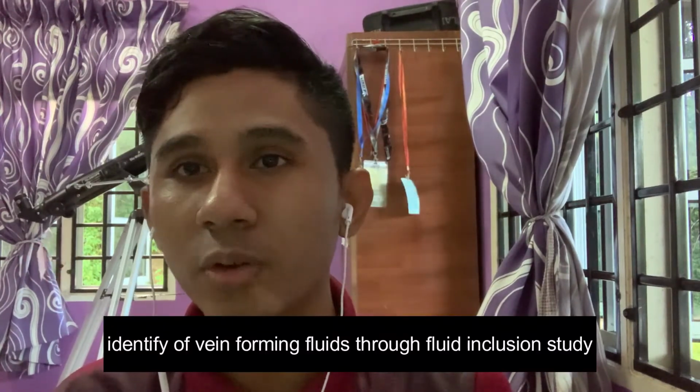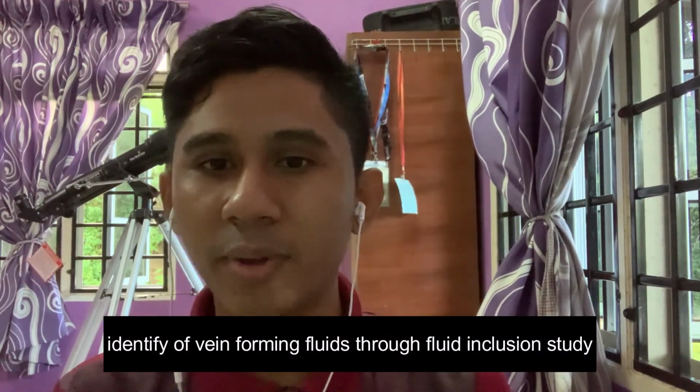Next, laser Raman also can be used to identify the vein forming fluid through the fluid inclusion study. Basically, fluid inclusions are microscopic entrapment of liquid and gas within the crystal. So the identification of inclusions will be in the transparent gems in a variety of minerals. So why is laser Raman used in this characterization? This is because the laser beam can penetrate a transparent mineral without causing any harm to its structure or composition. So this laser is used to penetrate the gem variety of minerals or crystal and collect the spectrum from the mineral inclusions inside the gemstone.